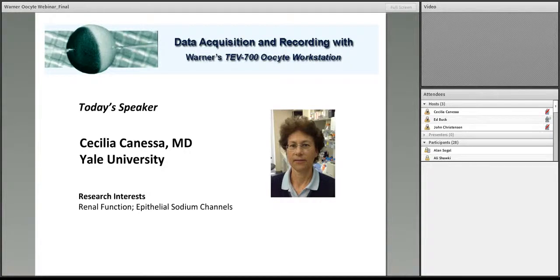Before handing the microphone over to Dr. Canessa, let's begin by watching a short video where she demonstrates the ease of working with the TEV-700.